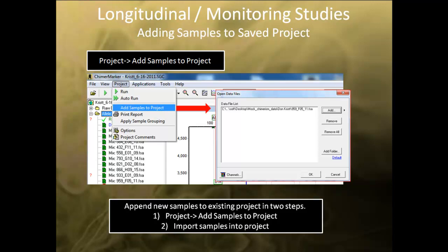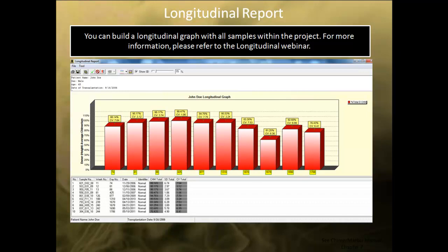Using this method, you can easily append additional samples as time goes on. In the chimerism application, there is an icon that opens the longitudinal report. These screens allow you to build a longitudinal graph using all data within a project. This graph can be used to monitor the fluctuations of chimerism within an individual for indication of relapse, mixed chimerism, or successful engraftment.